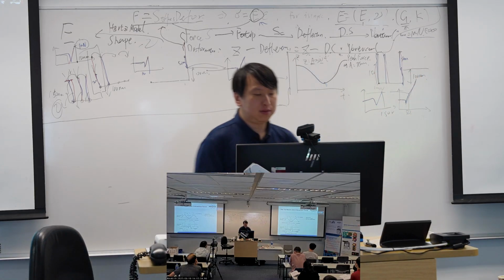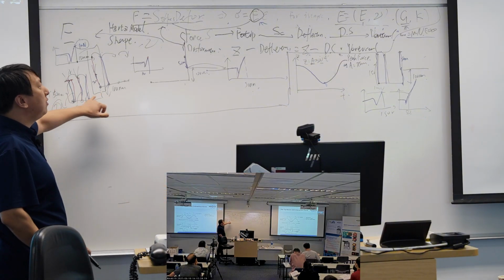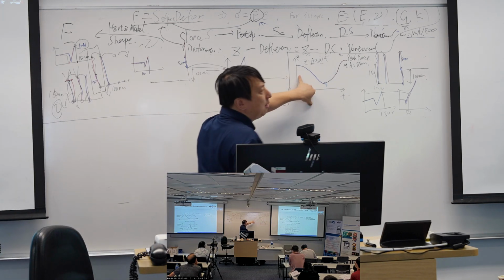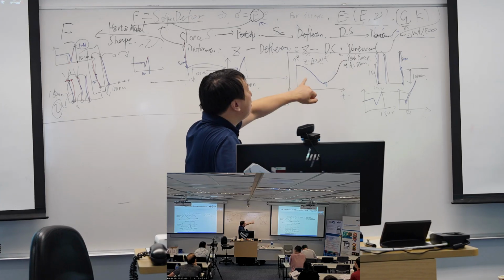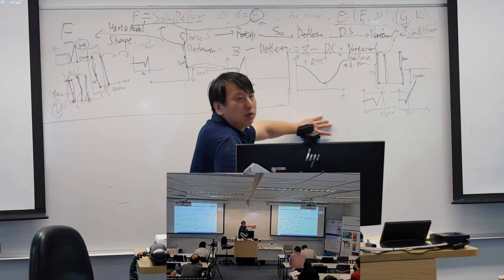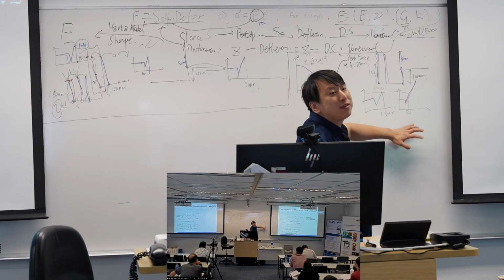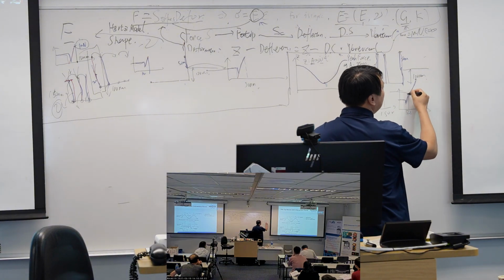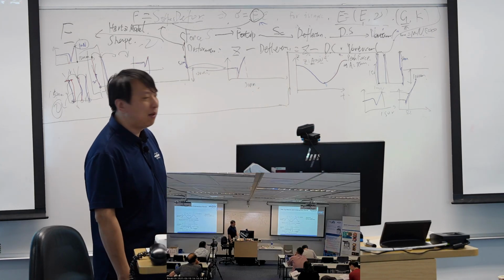Now the difference came out. In this one, it will retract once it reaches 1 nanonewton. But for this kind of peak force movement, the sine wave movement, the amplitude is fixed. I have to finish this amplitude. So we sacrifice the force. My force is already larger than the 1 nanonewton setup.